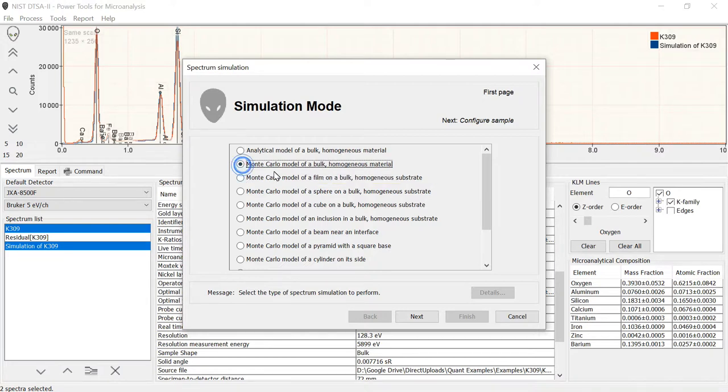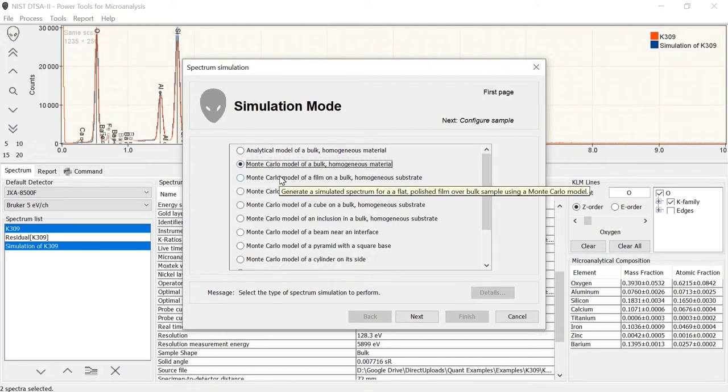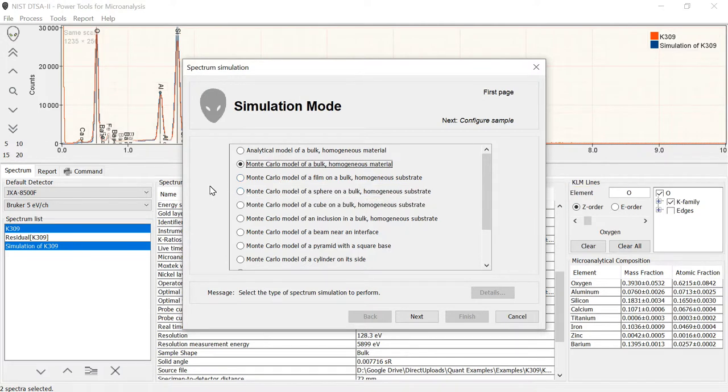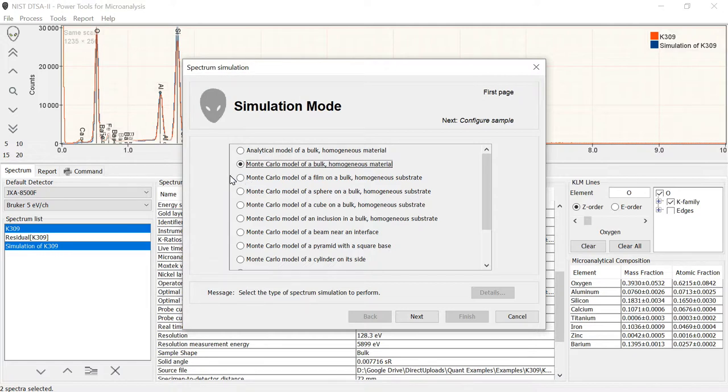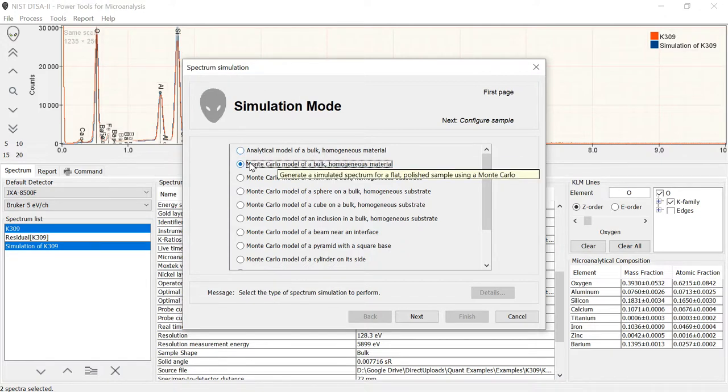But we also have some options based on what's called a Monte Carlo model. Monte Carlo model is a more time-consuming style of model because what it does is simulate the trajectory of electrons in a material in a randomized fashion. Stochastic model is what they call it. And then simulate the spectrum based on that model. Now Monte Carlos are great because they are very flexible in the sense that you can model a large number of different geometries. With the analytical model we can only model a bulk homogeneous material. With the Monte Carlo we can model lots of others.